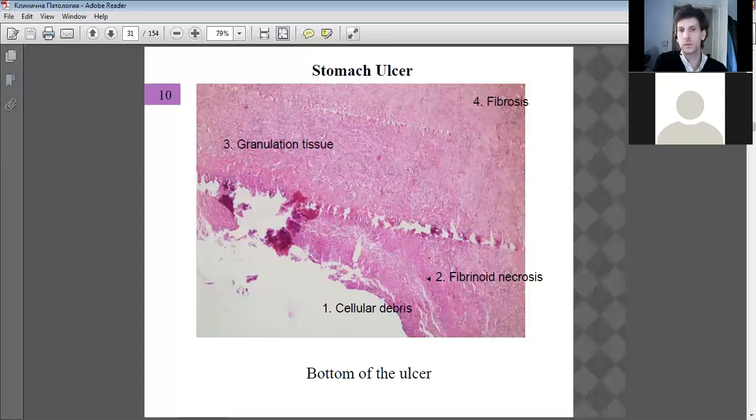So, this one. Yeah. Now that's an artifact of the sectioning, it looks like to me, the sectioning of the tissue, because the hard area and the softer, weaker areas, when you cut the tissue, it can sometimes tear it. So the blade would be coming this way, you cut in the section. So I would say this is because it's such a straight line. It's more the sectioning of the tissue. Yeah, okay.